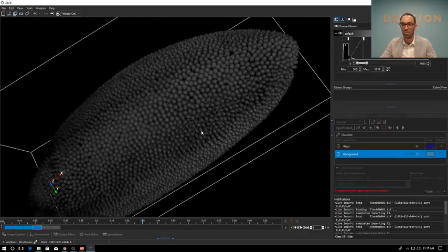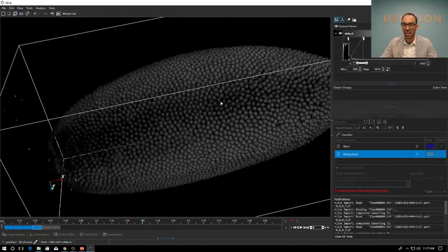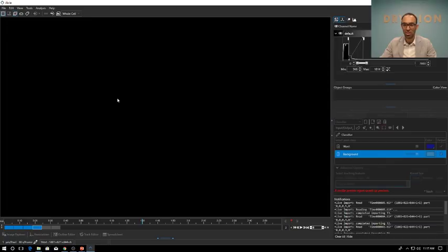Of course, all of you that are in the field would know straight away, but this is what it is, a Drosophila embryo. And you can also check it out in the 2D mode. Yeah, it's probably trying to refresh because it's already on time point 5 over here.